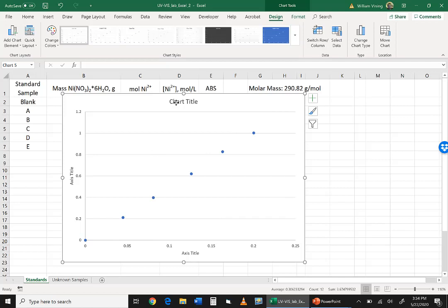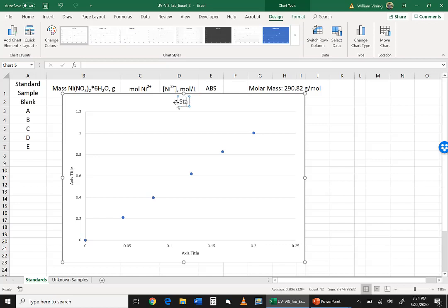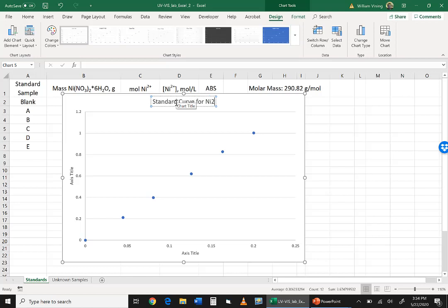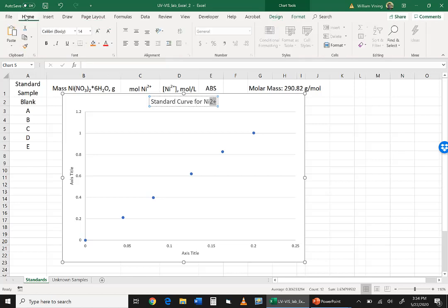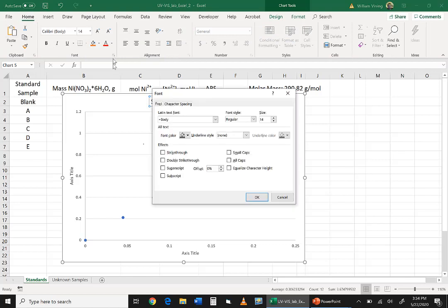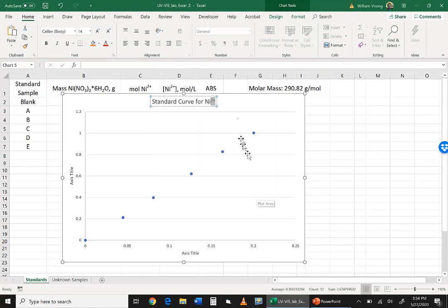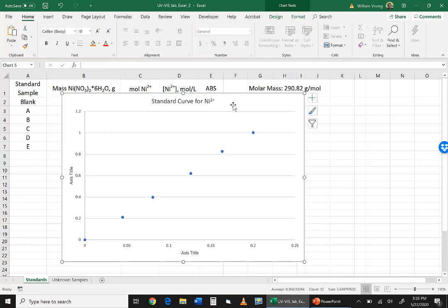Second thing is we're going to change our title to something useful. And so I'm going to call it Standard Curve for Nickel 2+. Now because we're chemists, the 2-plus has to be superscripted, and so I'm going to highlight the 2-plus, go home, click on the little expander thing for font, and click superscript. Okay, so that's that. So we now have a title for that.